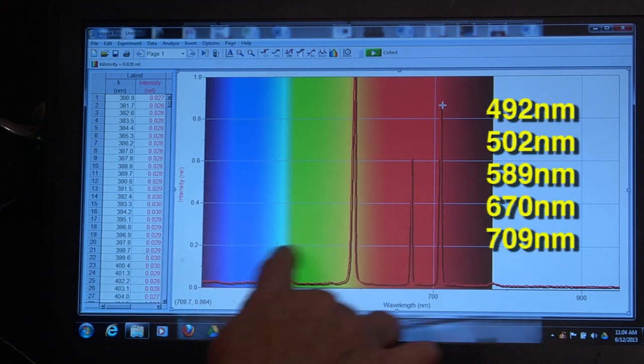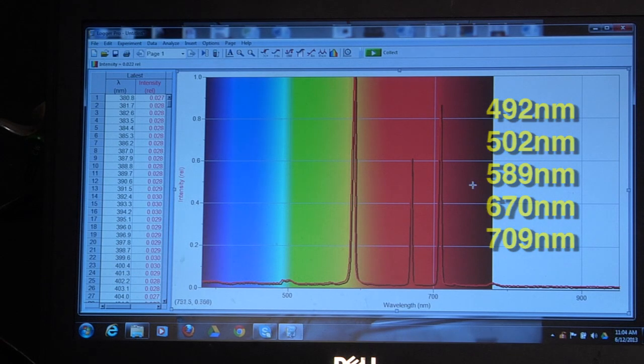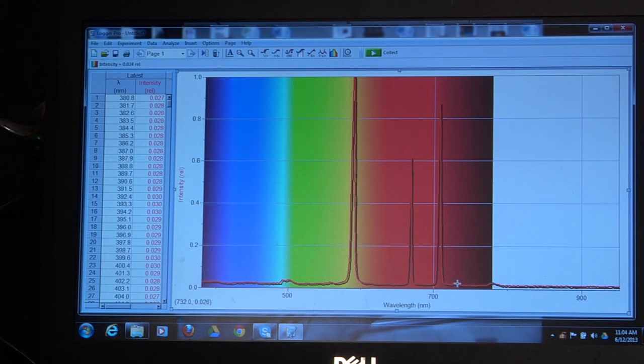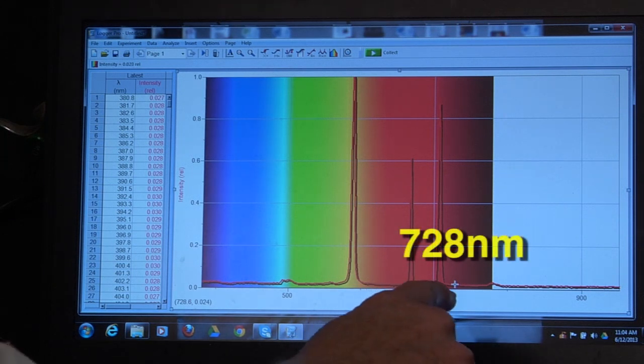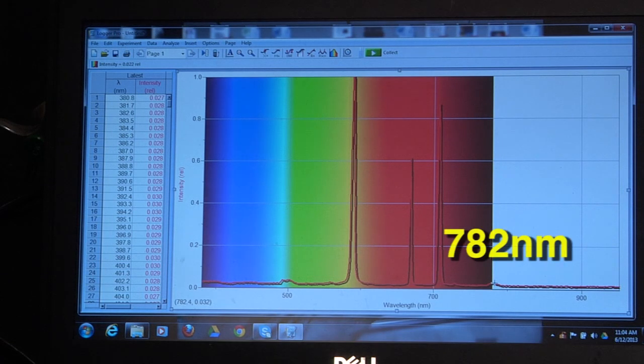So these five characteristic wavelengths. You can even see tiny ones here that are often very difficult to measure. One small one right here at 728 and another one here at 782.